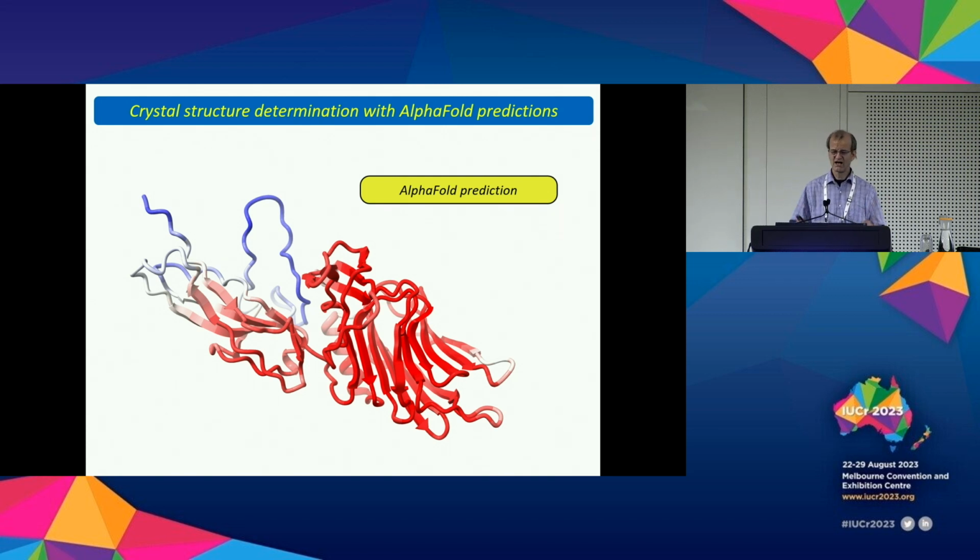So here's an AlphaFold prediction for 7OA7. Is that anybody's in this room? I don't know. Okay, anyways. Thought it might be. So high confidence is red and low confidence is white or blue. Okay, so this is what you get as your AlphaFold prediction in the beginning, and you can color code them by confidence.